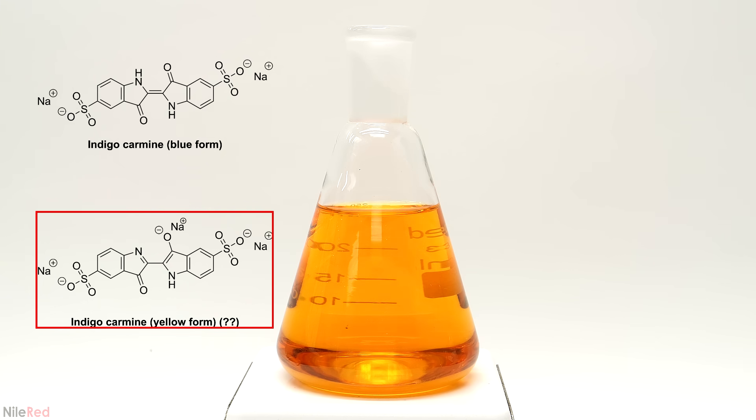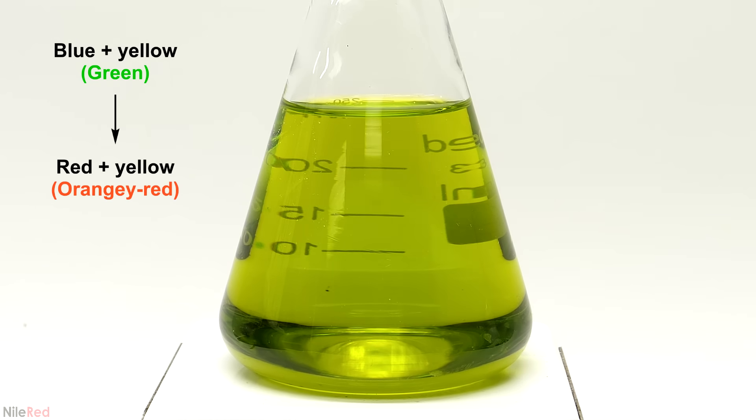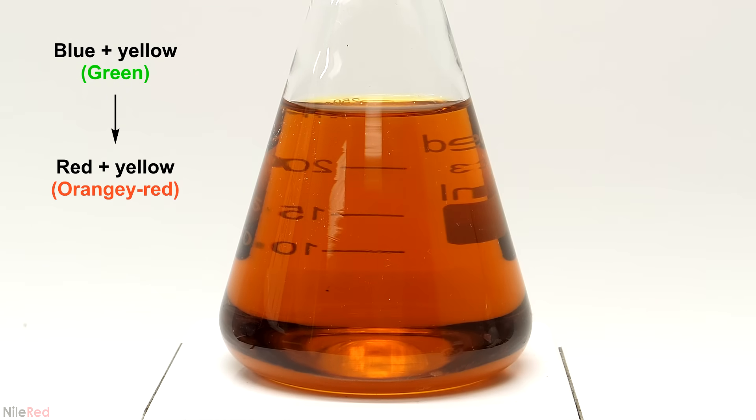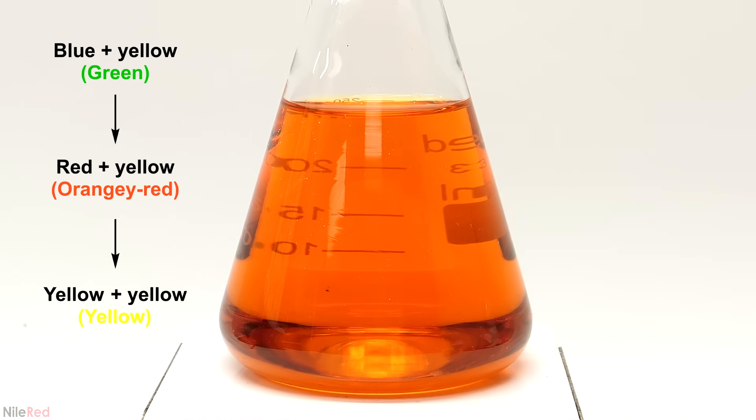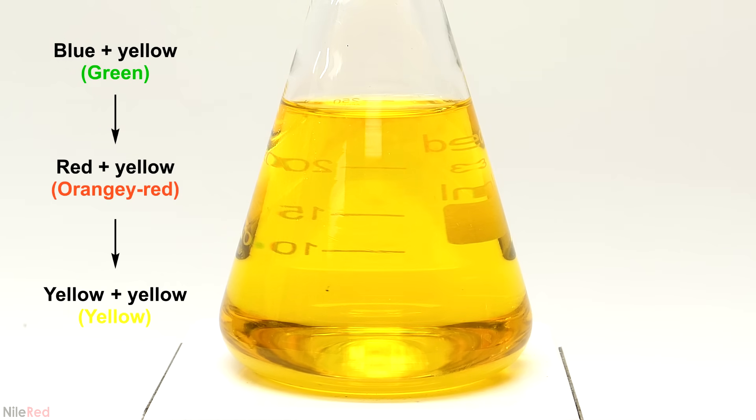One other thing that I wasn't able to find out was whether or not the yellow basic form of the indigo carmine was getting reduced as well. Every explanation that I saw was just for the regular blue form of it and nothing ever mentioned the yellow one. I think there is a chance that it might just be a spectator in this reaction and the color change is all because of the blue one. So for example as the blue one turned red the color changed from a mix of blue and yellow to a mix of red and yellow. Then when it was fully reduced it was a mix of yellow and yellow which of course just blended together.